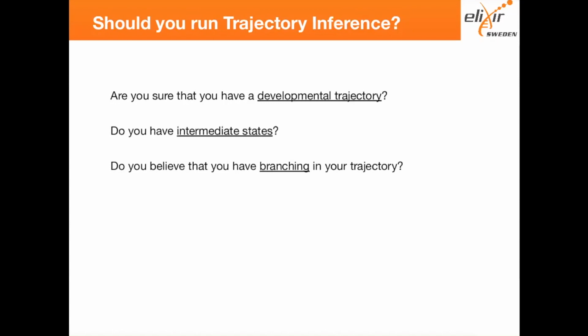So for example, if you try to do branching on the B cells, you can, of course, try to do that. But is that biologically relevant? So keep that in mind, depending on different, yes?